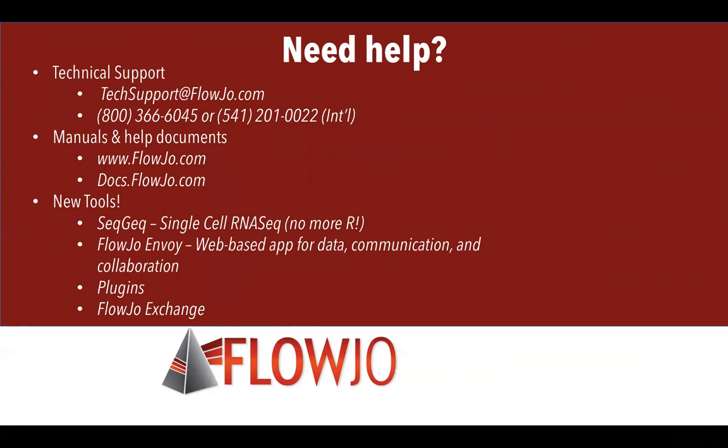Anyway, as far as getting help with FlowJo, aside from today's session where we'll do a walkthrough through a phenotyping experiment, I'll show you how to set up some layouts and get some data out of FlowJo, how to create tables, and how to generate a compensation matrix, among other things. There is additional help if you simply email techsupport@flowjo.com. So anything that you're looking for in the program, something you can't find, maybe you run into some sort of a snag in the program, by all means, just send an email to tech support.